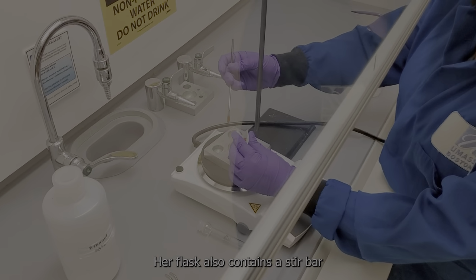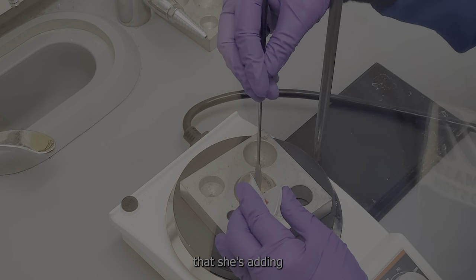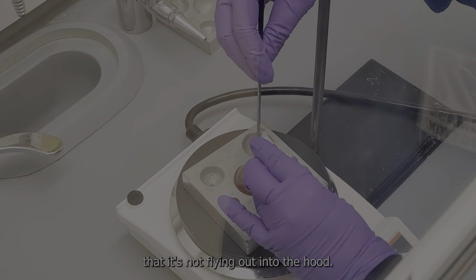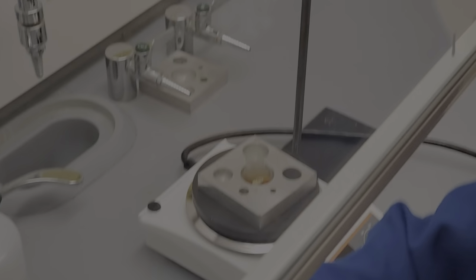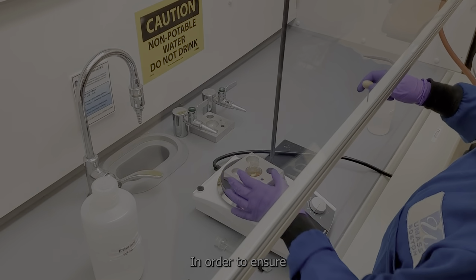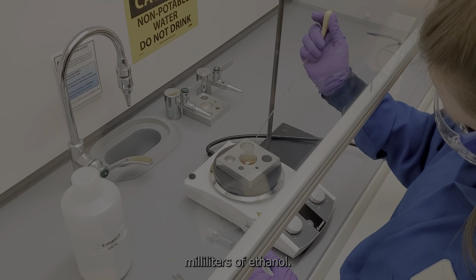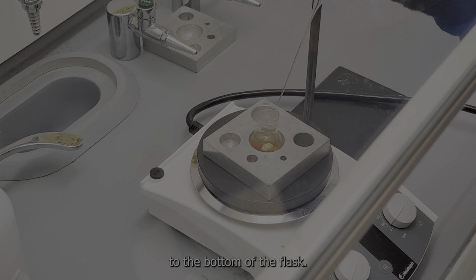Her flask also contains a stir bar as well as the ethanol and the E-stilbene. Once that's added, notice that she's adding the pyridinium tribromide. So she's holding the weigh boat flask to ensure that it's not flying out into the hood. And she's using a spatula to make any additions. In order to ensure that all of the pyridinium tribromide is in solution, she's going to add up to 2 milliliters of ethanol to rinse the pyridinium tribromide to the bottom of the flask.